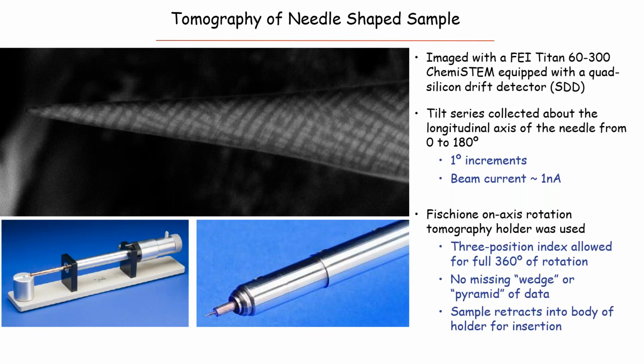We thinned it just like we thin an atom probe, and we have a holder here at the FEI, now Thermo Fisher, and Fischione holders, so we can use a different type of holder and start imaging this in the TEM. You can see at the top those square precipitates in the needle. It's about 100 micron long, and we can rotate this needle 360 degrees. We probably need about 180 degrees at minimum to know the morphology of the precipitate. Go ahead, next one.